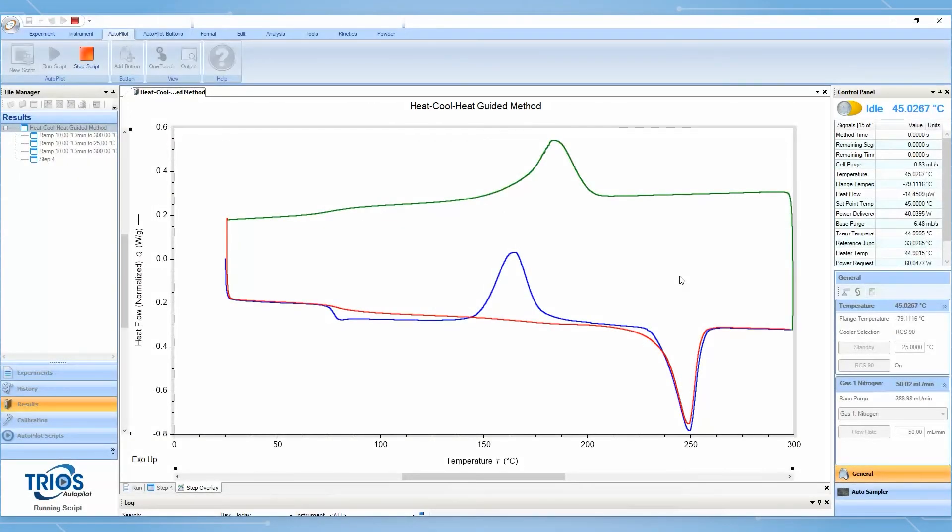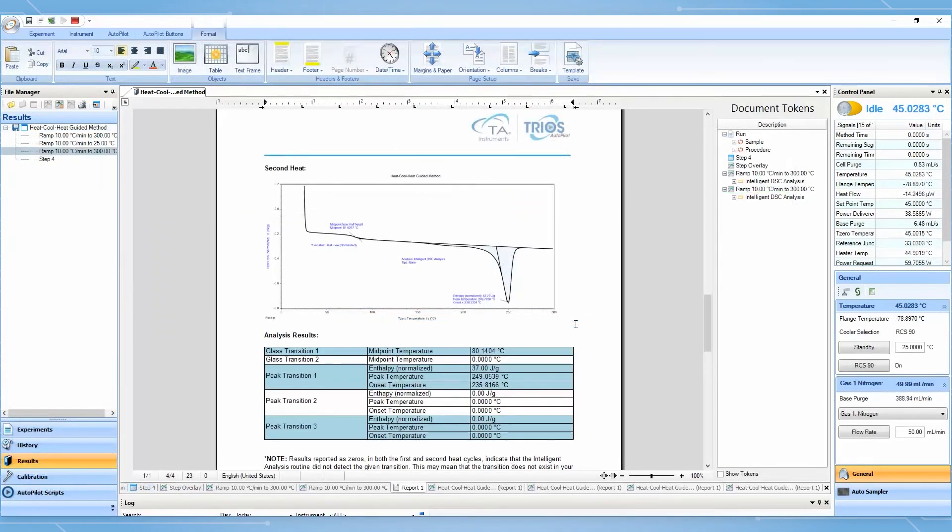After the test is done, the Guided Methods will automatically execute intelligent analysis to identify all detectable thermal transition events. Following this, the results are reported in an easy to export format.